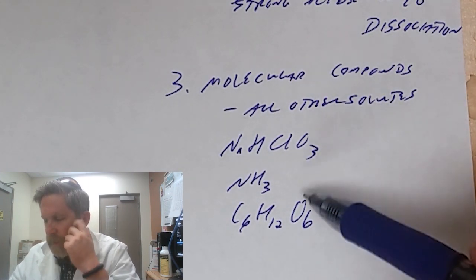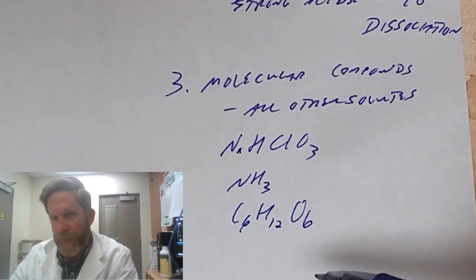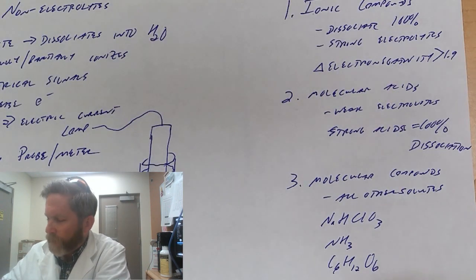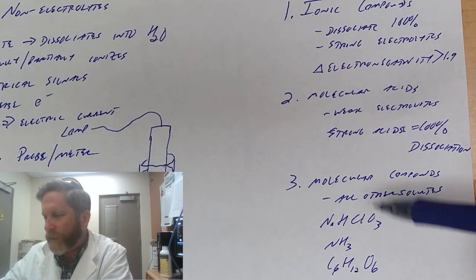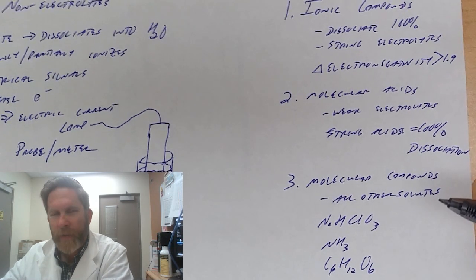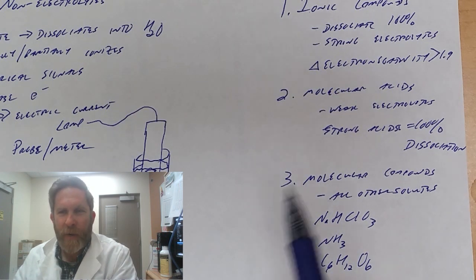Because some of them may or may not have any ionic portions, they may or may not actually cause an increase in the electric charge. So we're going to look at these in 3 groups, collect their conductivities, and then rank them based on their actual electrolytic state. Okay, so for the next part of the lecture, we're going to go into the lab and look at the actual conductivity probe, how that works, and set that up for you.